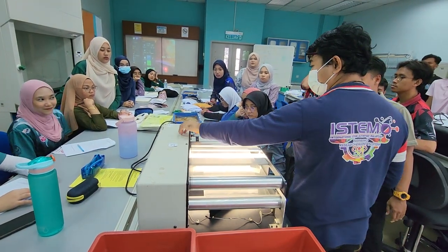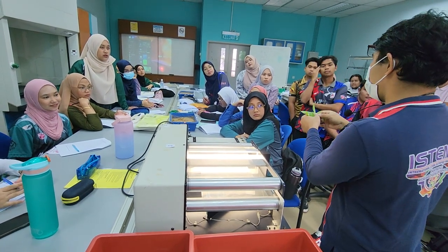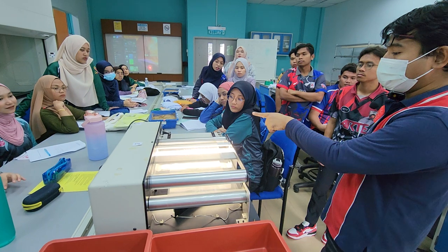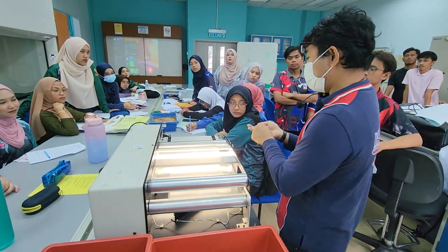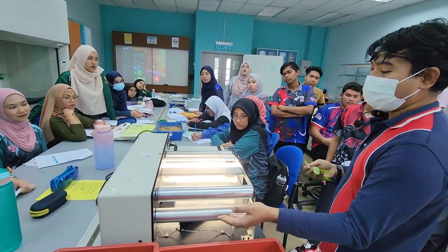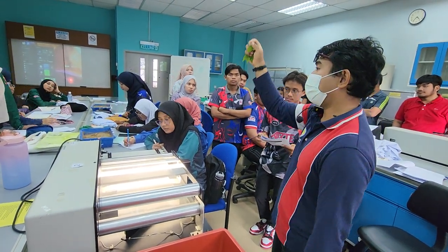Okay. Again, if you think your palmate leaf is kind of overlapping in nature, it doesn't hurt to do it by leaflet. Okay, make everything flat, then you'll get the reading, which is 74.65 square centimeter. And this is adding up, okay? If you don't reset it and you put a new leaf, it will add up. Easy. Okay, once you got it, go to table 4 and start filling up all the data.